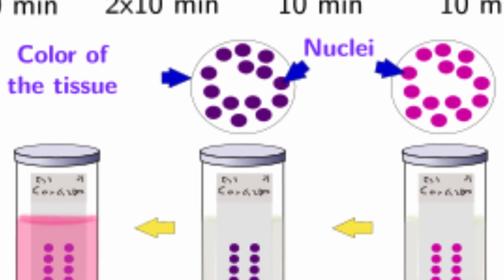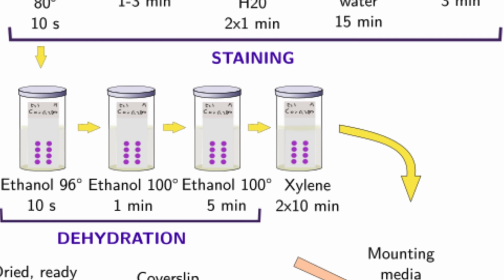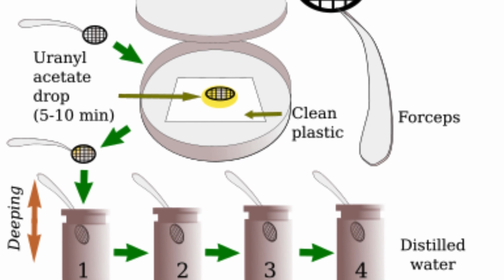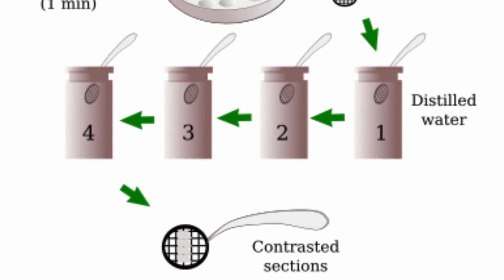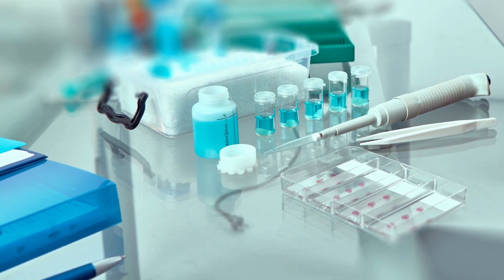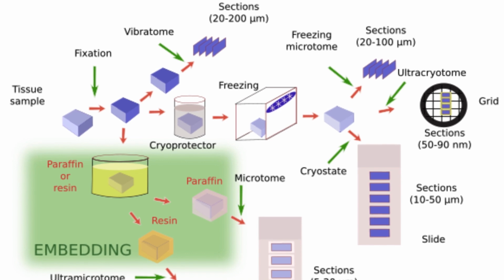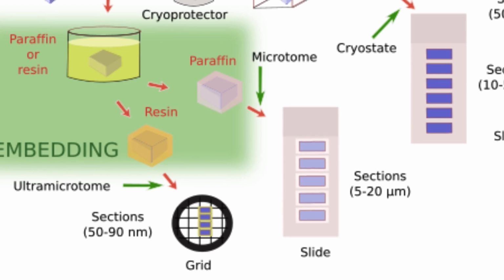2. Histological staining principles. The chemical and physical interactions that involve the tissue and the dye are the basis for the basic concept of histological staining. These may include basic and acidic staining. While some colors are basic, others are acidic. Basic dyes, cationic, combine with acidic components like nucleic acids, that is, DNA and RNA, whereas acidic dyes, anionic, combine with basic tissue components like cytoplasmic proteins. This differential binding increases contrast between different parts of a cell.